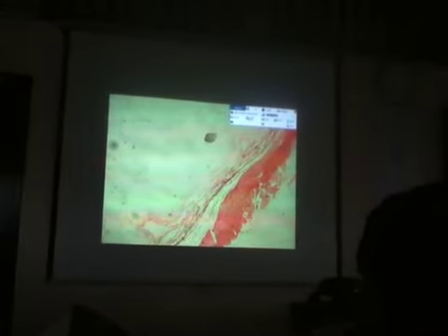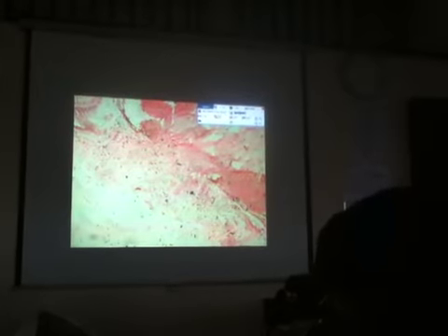Although we cannot see anymore the actual appearance of their axons, they are on the surface of the retina. The axons are aggregating with each other, and eventually the axons will form that nerve, which is called the optic nerve. Why is that portion, the optic disc or the optic papilla, considered as the blind spot of the eye?